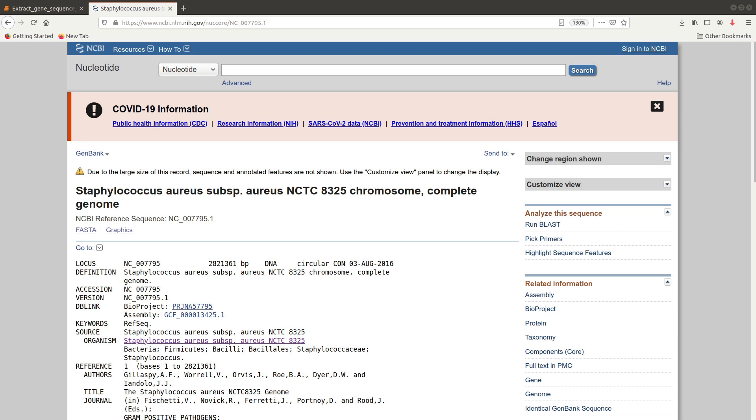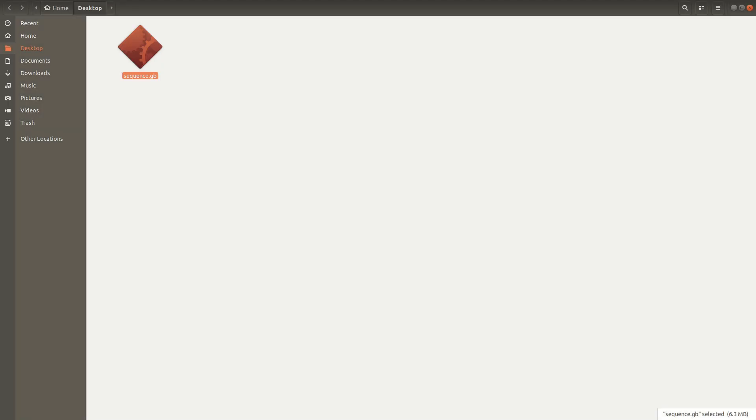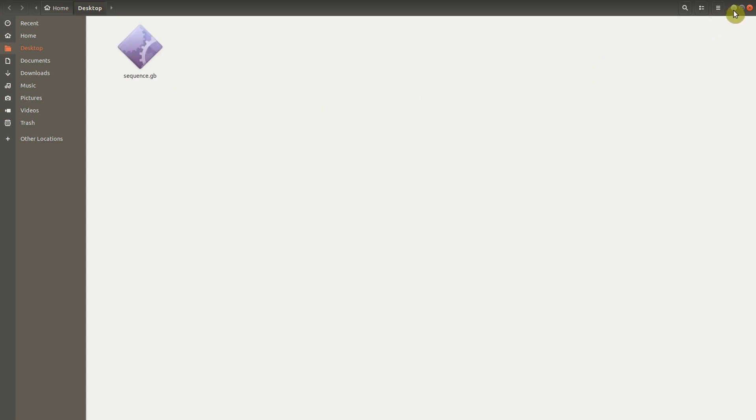Download is complete, so we can check the download target directory, which is desktop in this case. This is my file. You should make sure you have the path and the name you used to save it at hand. Let's go to the Python terminal to start the analysis.